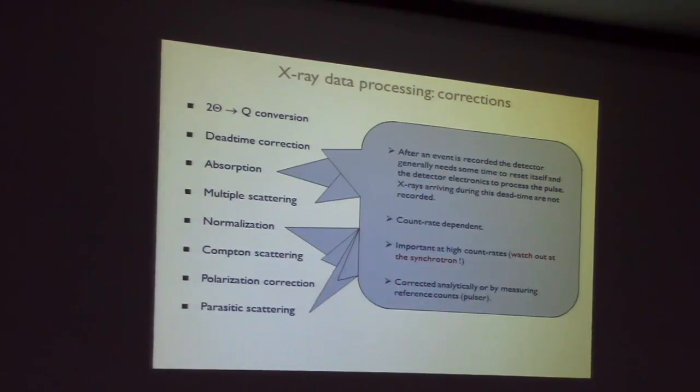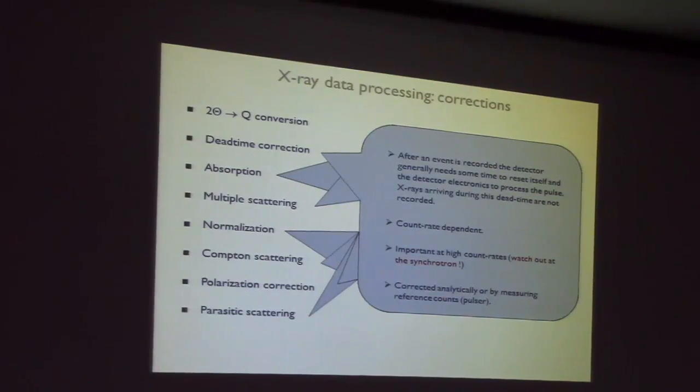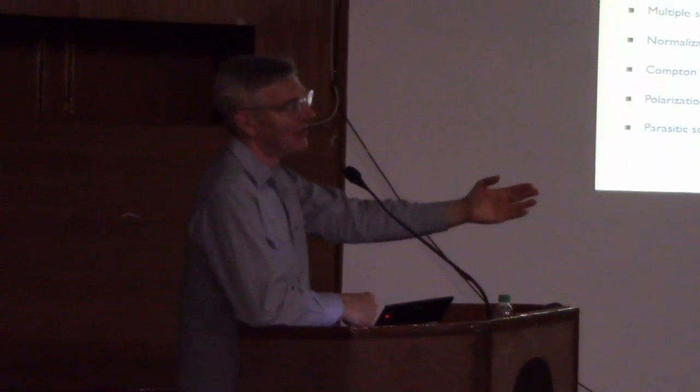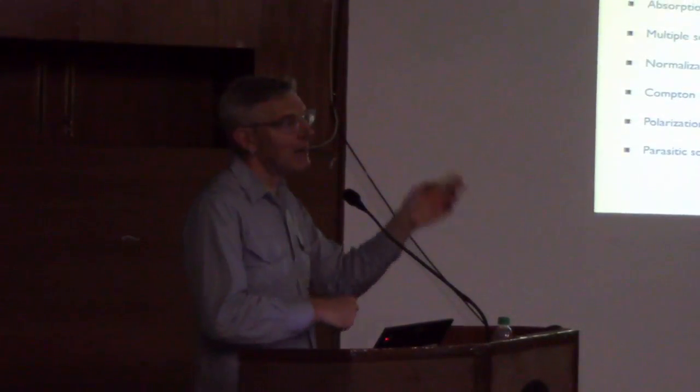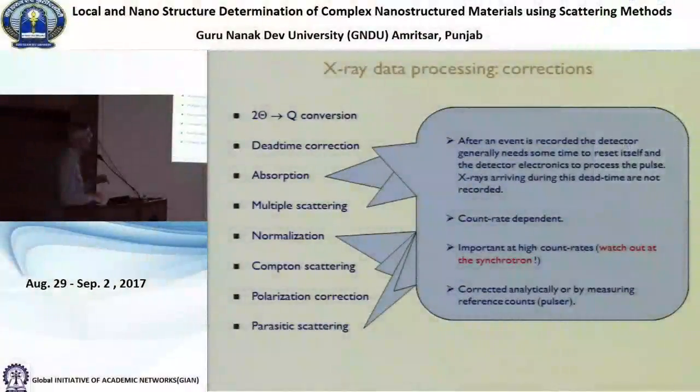If you have a photon counting detector, you have to worry about dead time. Remember, with the photon counting detector, the X-ray came in, it ionized the gas, the charge got attracted to the high voltage wire, it produced a pulse of current that went down the wire into the pulse shaping electronics, and then it came out as a count in your counting program.